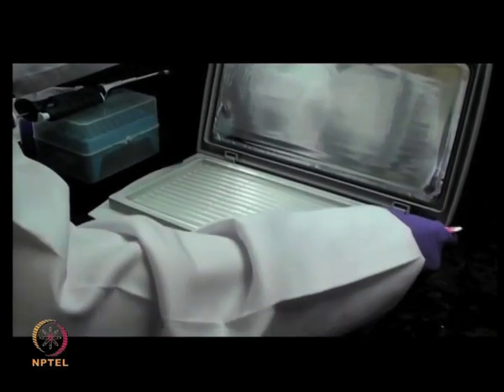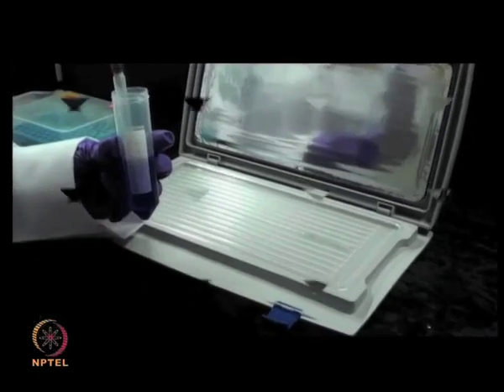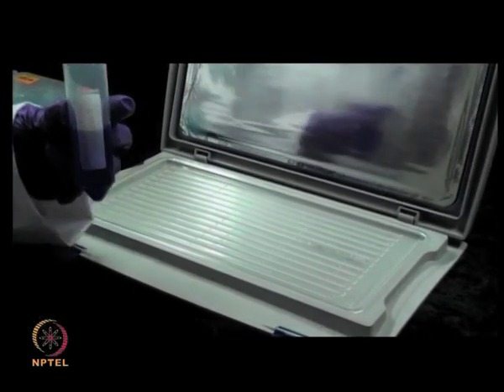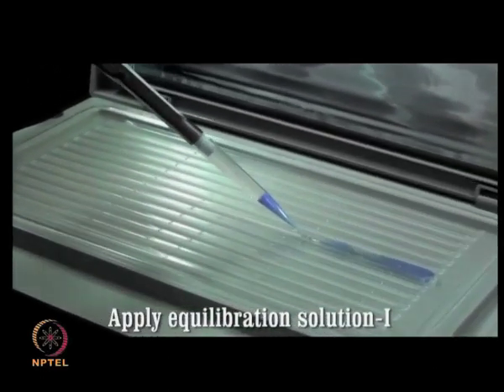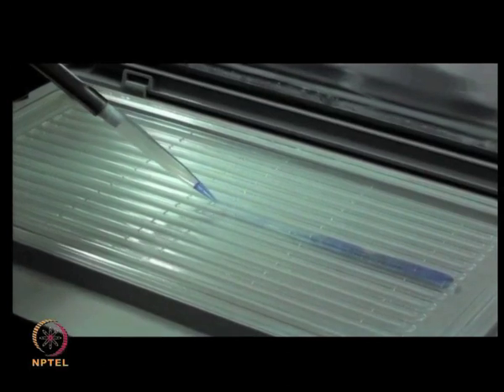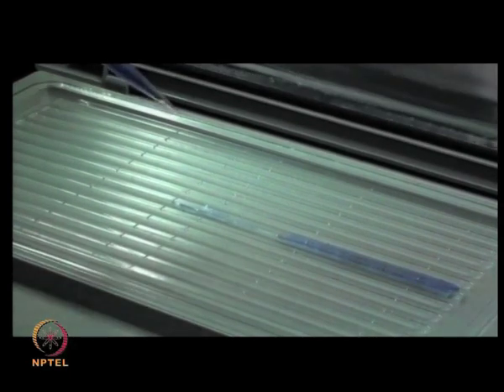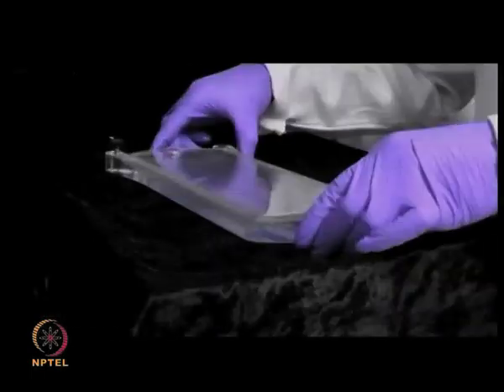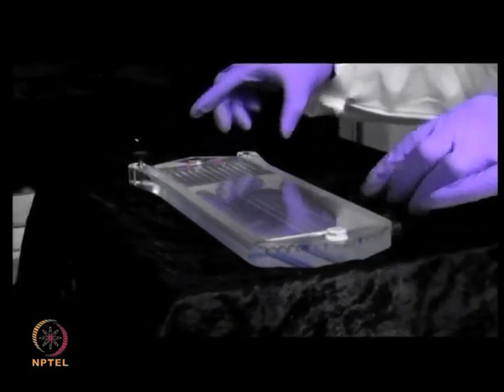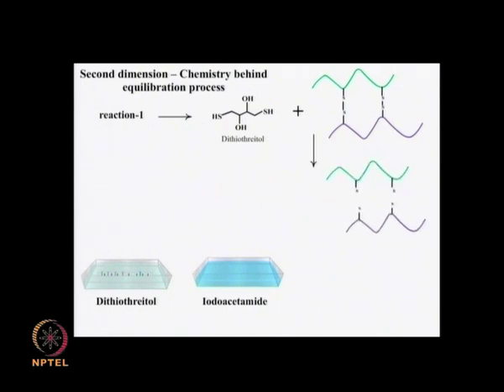Place the thawed IPG strip in the tray, and over it pour the first equilibration solution consisting of urea, Tris-HCl of pH 8.8, glycerol, SDS, bromophenol blue, along with dithiothreitol or DTT. Place the assembly on a mechanical shaker for 10 minutes. The dithiothreitol enables cleavage of all disulfide bonds present in the proteins on the IPG strip.